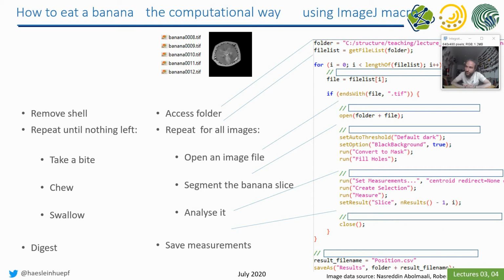So I bet you do, because you did this going through a folder of files and segmenting it and doing some measurements and saving the measurements. You did this a couple of times during this semester. So maybe at the beginning of the semester you felt unconfident when looking at this, and I bet now you can just read it. If not, practice it.